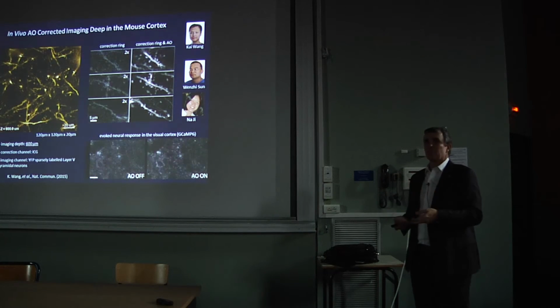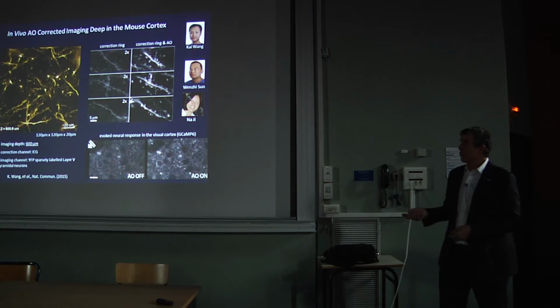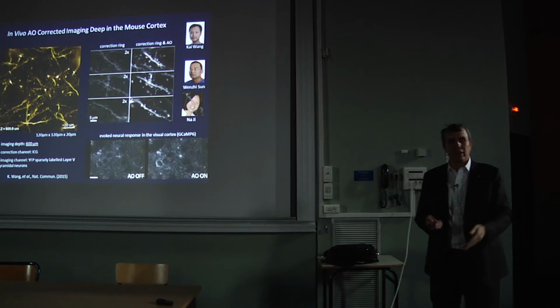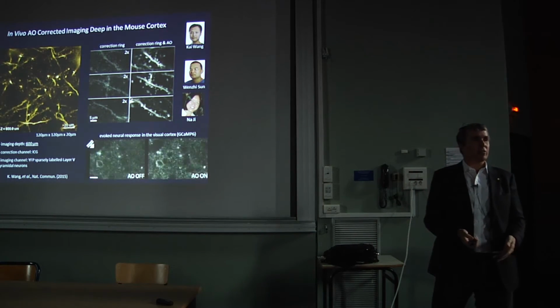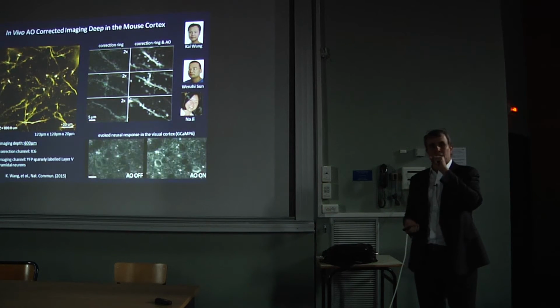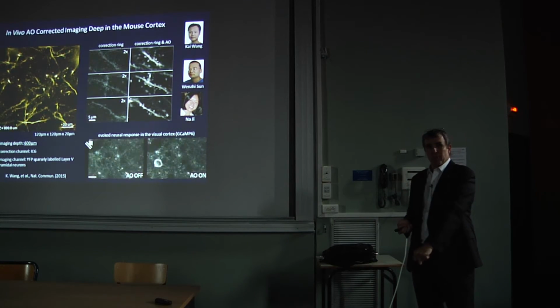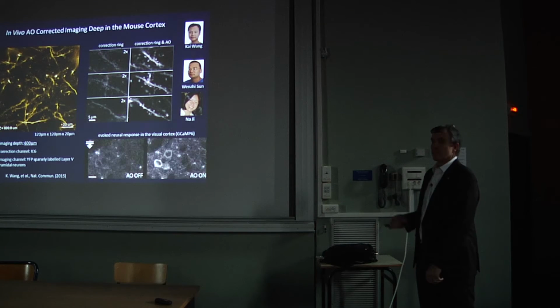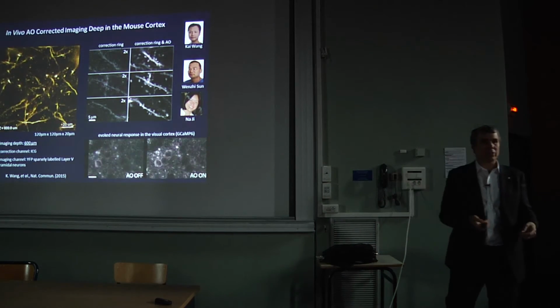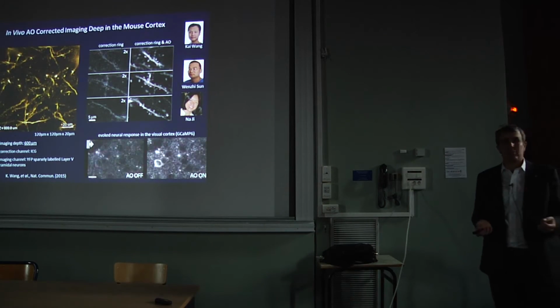So that's why people use 2-photon microscopes, because they have infrared light that can penetrate more deeply. So what we do in that case is that we either use an infrared dye or co-transfect with an infrared fluorescent protein, and then we can use an infrared guide star, which isn't as scattered, still be able to see that at great depth in the mouse brain, all the way through the mouse cortex, and then still get spine resolution with the adaptive optics. And then a great improvement, particularly when you're doing functional imaging of neural activity by these genetically encoded calcium indicators.